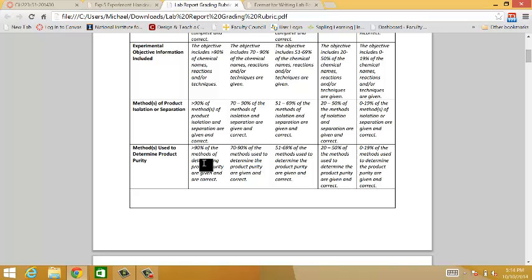This was supposed to be a yellow oil. So if you had a dark brown oil, or if it was black, in some cases I saw a couple of those, that's an indication that the sample isn't completely pure. How impure is it? That's what we have other methods to do, but always include observation, always include the appearance of the product as a method of product purity.